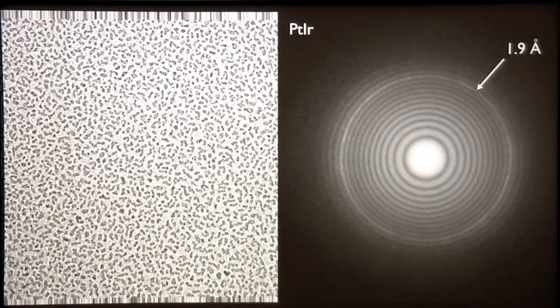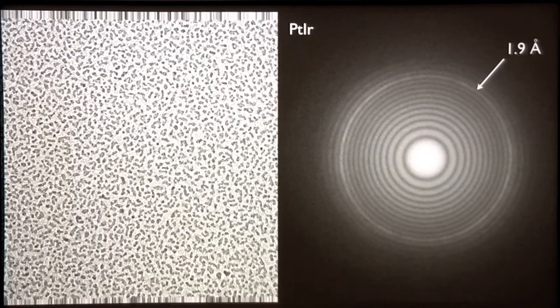And I check the alignments, I do whatever alignments I want, and I make sure that I can generate a pattern that looks like this. Right? And if you do that first, then you know for certain that the optics are not going to be limiting your experiment. It's going to be your sample or something about it. And if you can't generate one of these patterns with a test grid, then you should talk to somebody or get some help or figure out what's going wrong.